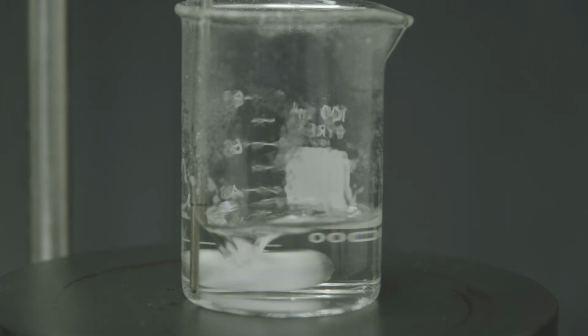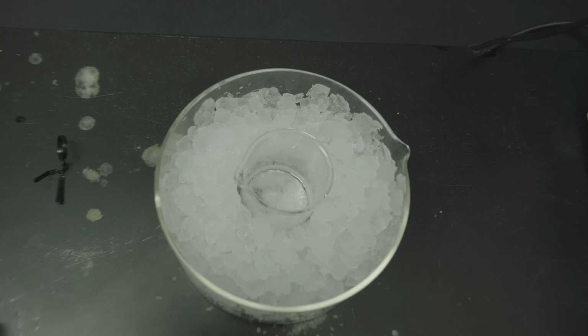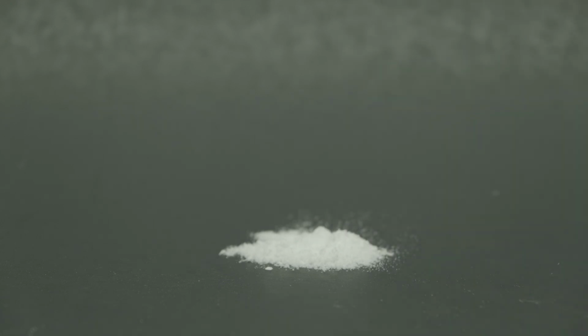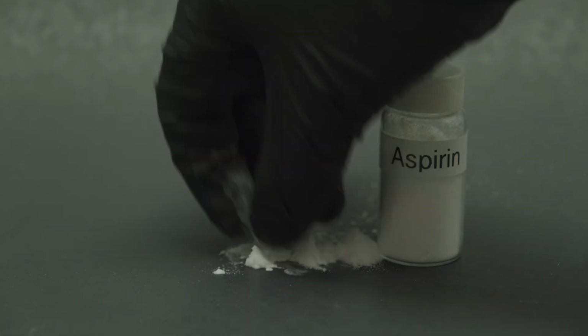The biggest difference this time was I was going to let this stir and synthesize for 40 minutes. And this seemed to do the trick because I also got nice crystallization here, and when I finally dumped out my powder, I was really anxious to see if I had actually made it work. Could I really label this aspirin? We'd have to find out.